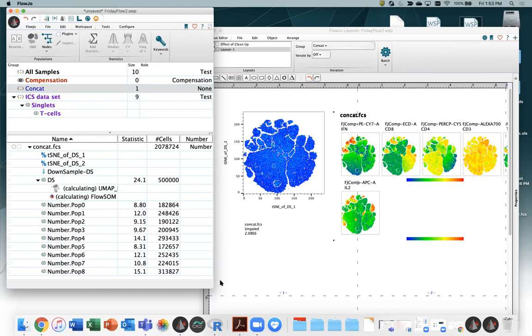Yeah, it's absolutely based on computing power, but probably even more so the size of the data that you hand it. So at the moment, I've given it 500,000 events, 7 dimensions. So, that's probably actually a middle of the road kind of size data set. t-SNE, I will claim, ran in 8 minutes or so.